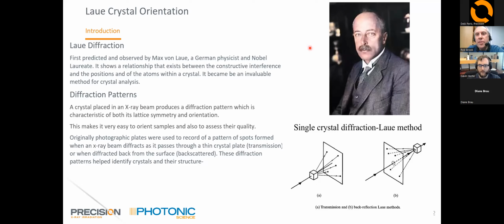He used collimators in between the X-ray source and the crystal to ensure the beam was essentially parallel when it hits the crystal. And you need to use a polychromatic source, like an X-ray source, that has a range of wavelengths, because the diffraction that is produced uses the full range of wavelengths that come from the source.